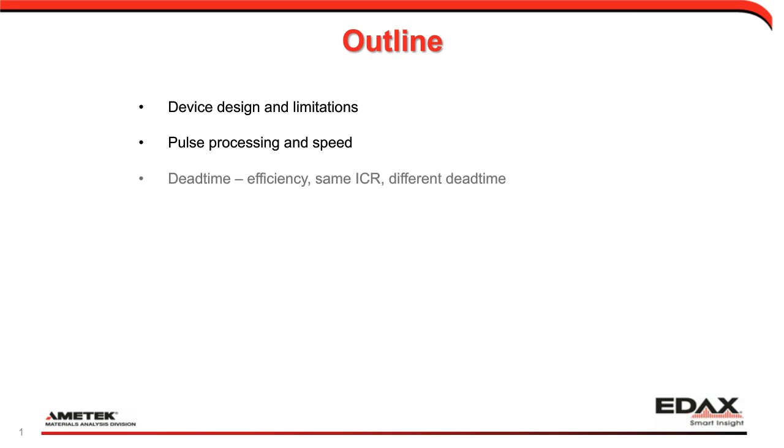After that, Tara will go through a few examples of what we gain when we change the processing speed, the step time changes, and how that relates to efficiency with a few different examples.